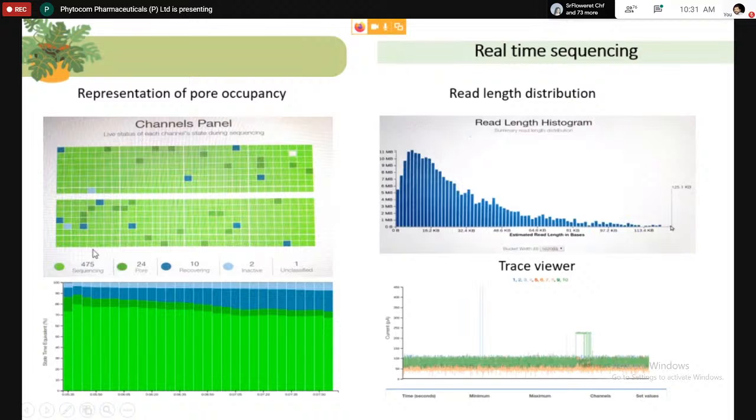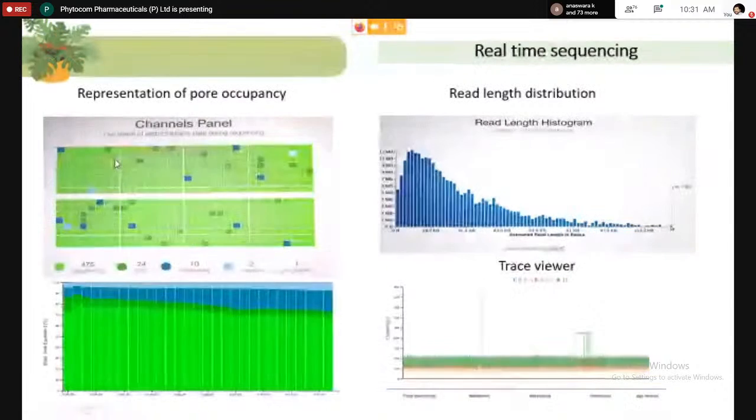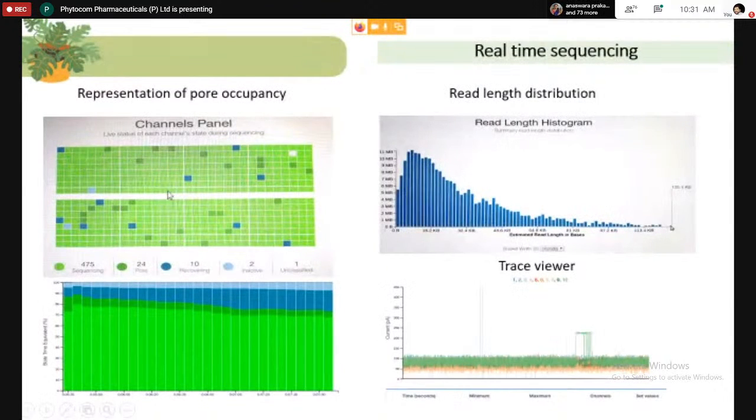First, when we attach the flow cell to the computer and run the flow cell using the MinKNOW program, the program will check all these pores and arrange them in such a way that the highly active pores will be used first. They will also be categorized into 4 sections. That is called mux scanning. In the mux scan, groups 1, 2, 3, 4 will be assigned based on the ability of these pores to sequence the DNA.